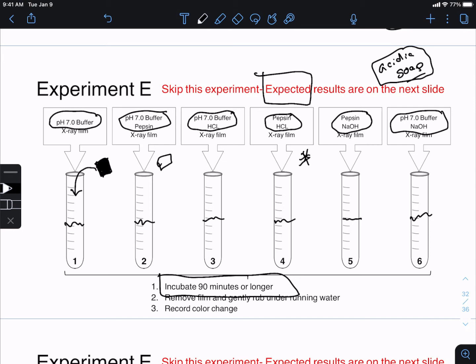The strips are cut; they're actually slightly different sizes. Ideally they would all be exactly the same size, but let's be real. Life being what it is, we're very lucky to have a wonderful team of lab techs preparing this for us for the hundreds of students that do these labs. So we can forgive minor differences in sizes here.